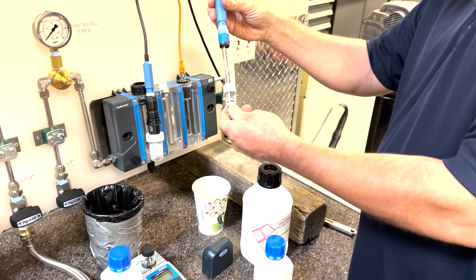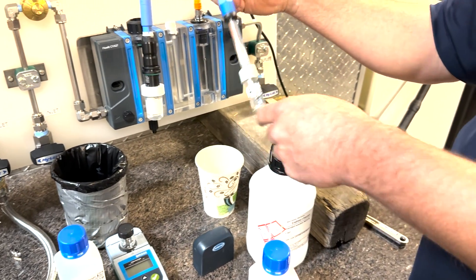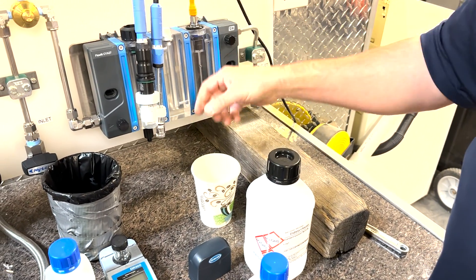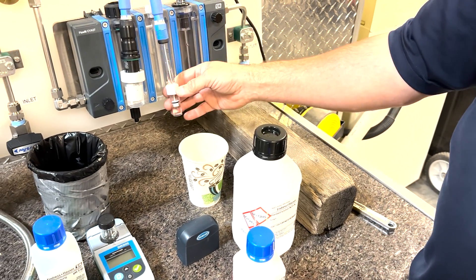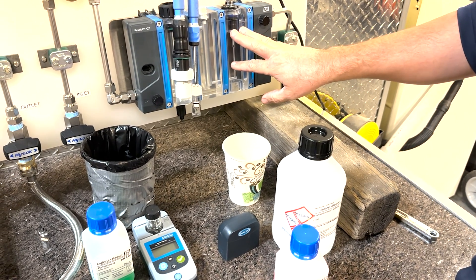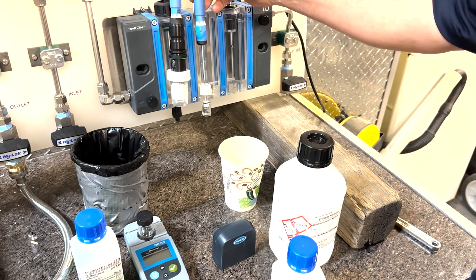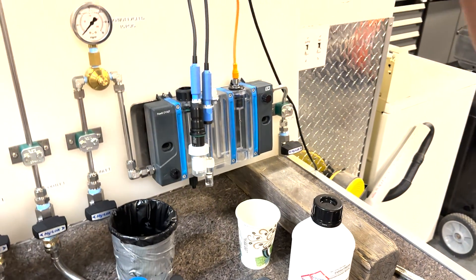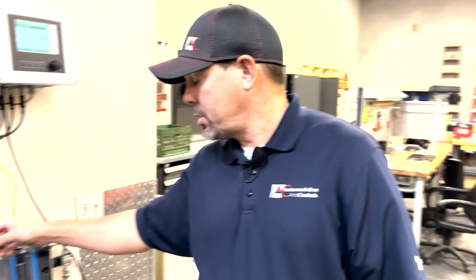The important thing to remember with these sensors is that they need to remain wetted — whether they're in the kit cap that comes with the sensor or installed in your flow block. You want to make sure that the flow block stays full of water or the process medium. If they dry out, they will go bad. And that is it for calibrating a pH probe.